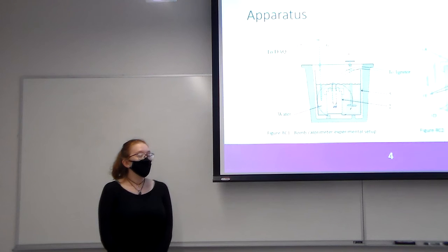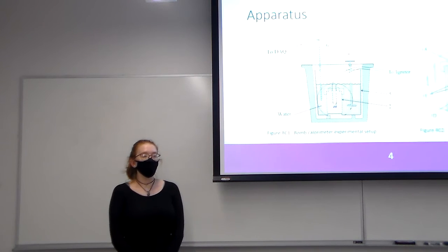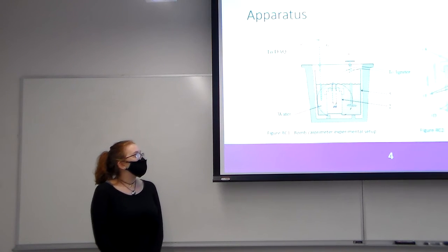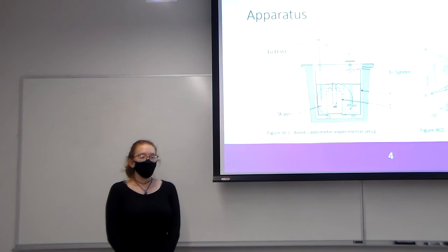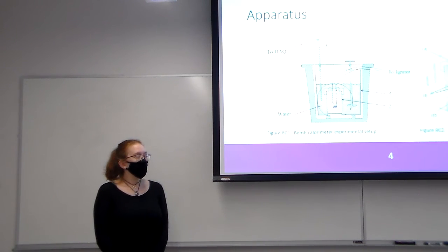but before we can do all that, we have to properly seal it. Inside the lid of the bomb calorimeter is a thermocouple, which will be connected to the computer, which is how we'll determine the change in temperature, which we've done in many of the experiments. Also attached to the lid is a stirrer, and what this will do is rotate the water and keep it moving so that the temperature distribution is even and constant. Thus we can get a better reading and eliminate errors from that.